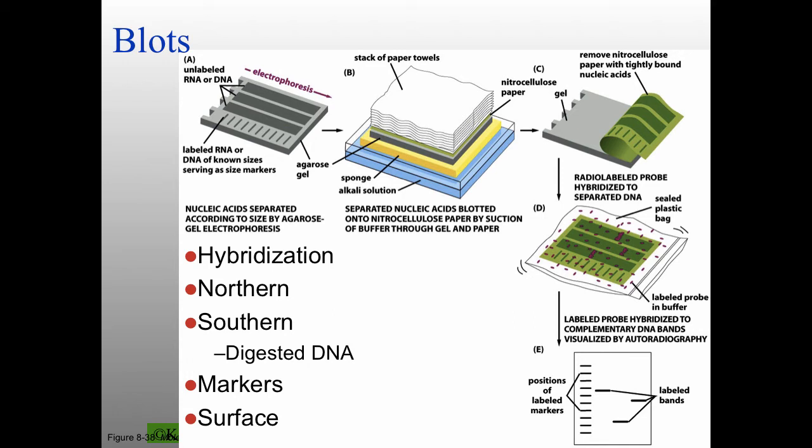In the case of an agarose gel, anything between 0.5 cm and 1 cm. The other thing is, even if you are using polyacrylamide gels, which are much thinner, you've still got to get your probe to it. It's a lot better if you have your DNA stuck on a surface. And how you get that to happen: you separate your nucleotides on some kind of gel. Again, usually this is going to be an agarose gel. And basically, you transfer this to a membrane.